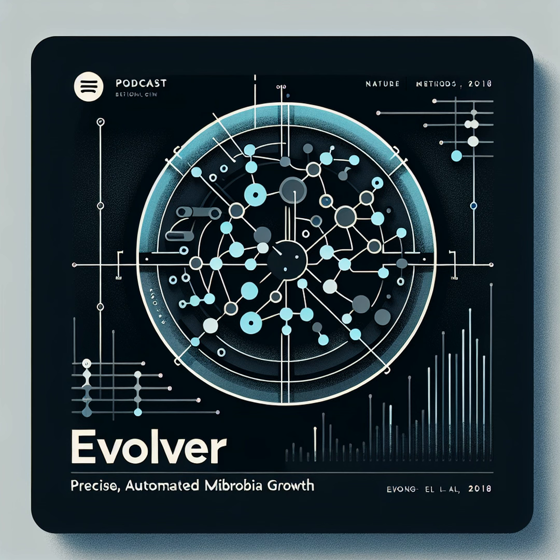In essence, eVOLVER offers a versatile and scalable platform for high-throughput experiments. Its modular design, combined with sophisticated fluidic control and real-time feedback, allows for unprecedented precision and throughput in studies of microbial evolution and functional genomics. It's remarkable how this system addresses the long-standing challenge of balancing control and scalability in biological experiments. The implications are huge, aren't they? Absolutely. eVOLVER accelerates experimental biology, opening doors to deeper insights into evolutionary processes and cellular responses to environmental stresses. It's a real game changer.